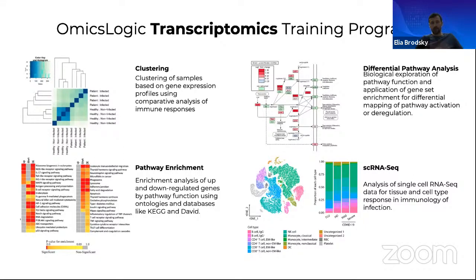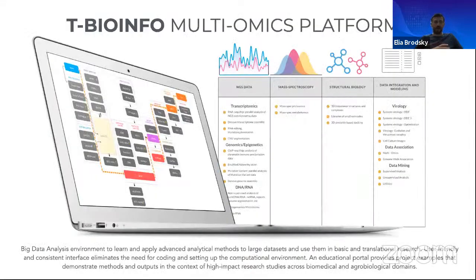And so, as you probably know already or can imagine, one of the major challenges associated with such big data is just the size of RNA-seq data. So RNA-seq data sets from a bulk RNA-seq experiment can be anywhere between 1 and 50 gigabytes, depending on the sample size. And single cell data sets can be even larger due to the large cell counts and also large sample size as a result.